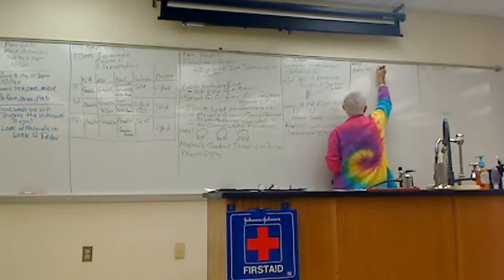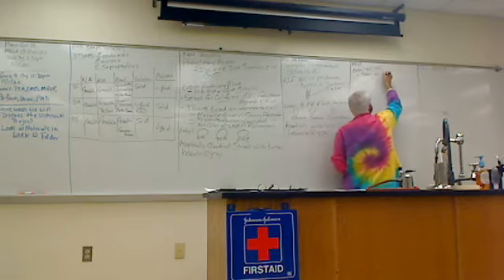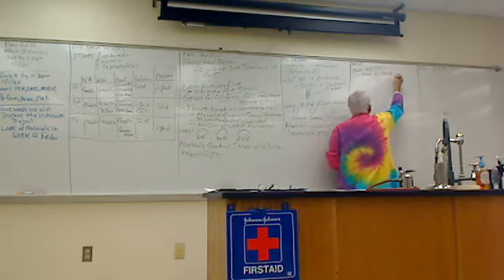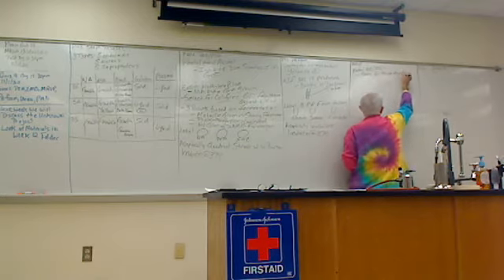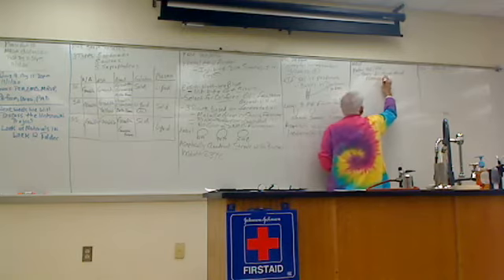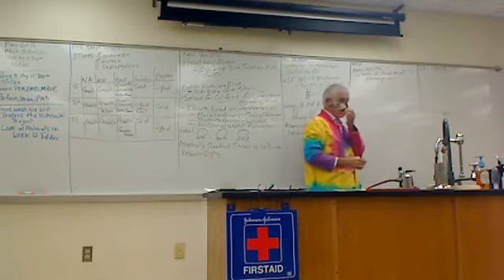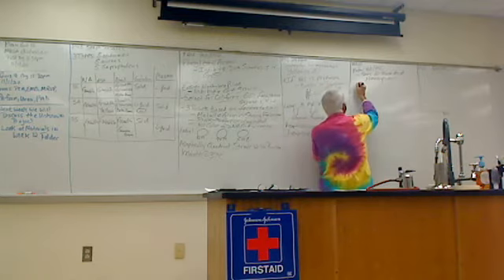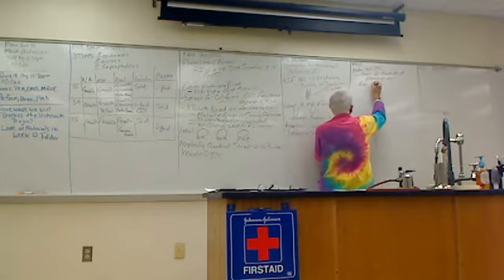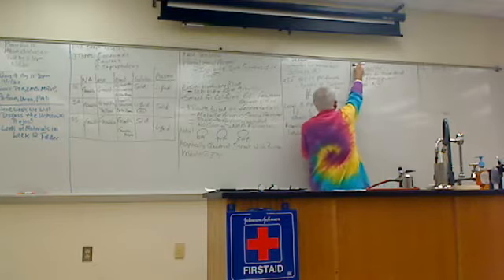Methyl red, that's the MR, and this tests for mixed acid fermentation, mixed acid fermentation, and red is positive. Everybody got that? So that's the MR part.